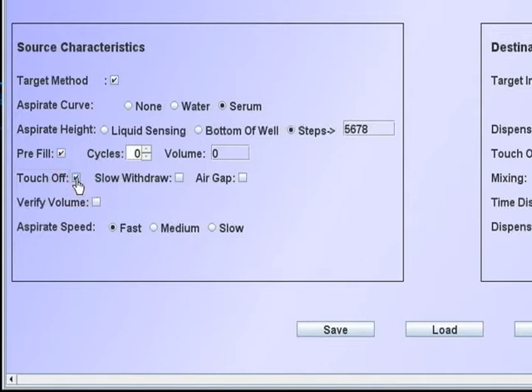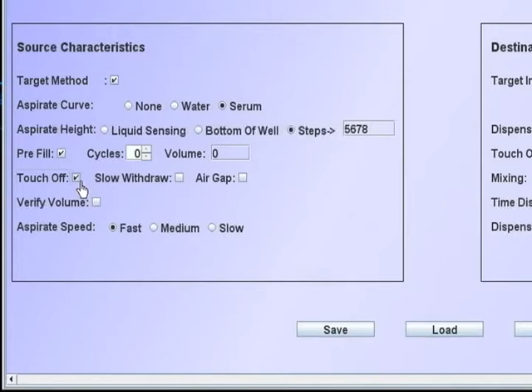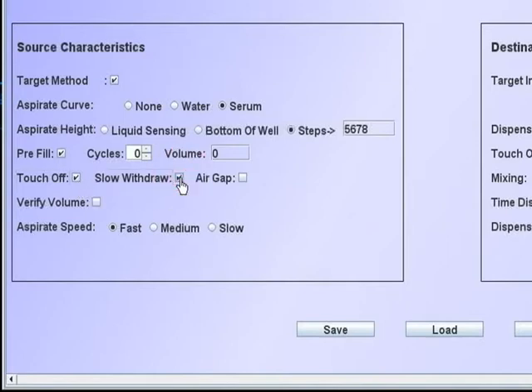The touch-off function will cause the tip to move sideways at the top of the well as defined in the plate database. This is to assist in touching off a clinging drop after the aspirate. A slow withdrawal is available whenever the tip leaves a liquid of any depth.